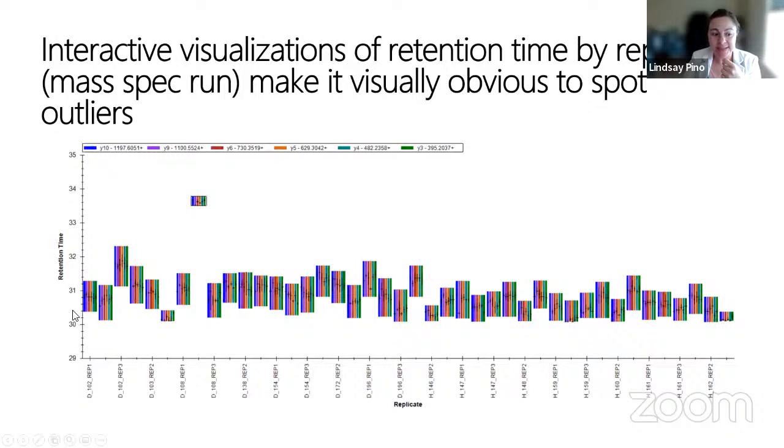In the box is the start of the chromatogram, the start of that peak, and then the end of that peak. If you look across, there's a little bit of wiggle room for all of these samples. Retention time isn't perfectly reproducible across different samples because each sample has a very slightly different matrix, and even slight differences in matrix will change the retention time just a little bit.